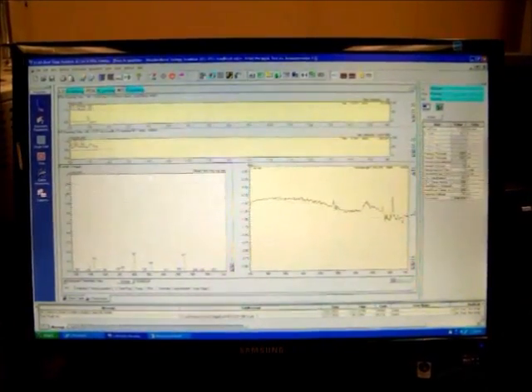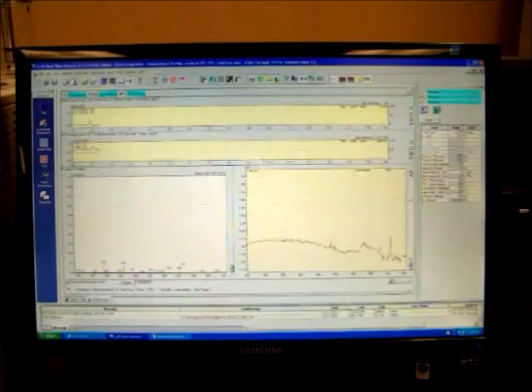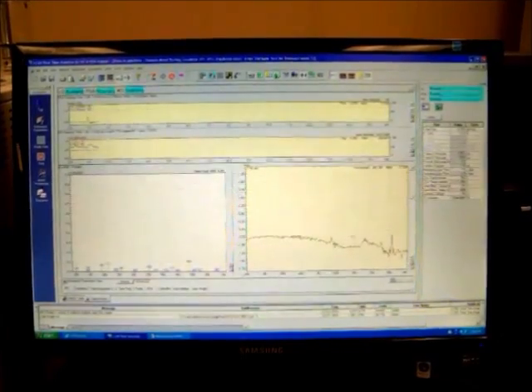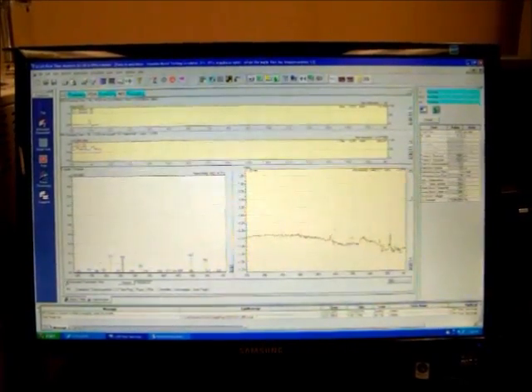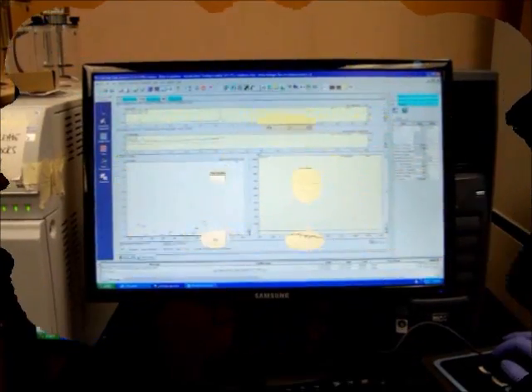So in this particular instance, it's below zero. So we're really not detecting anything. Nothing is coming through the mass spec.